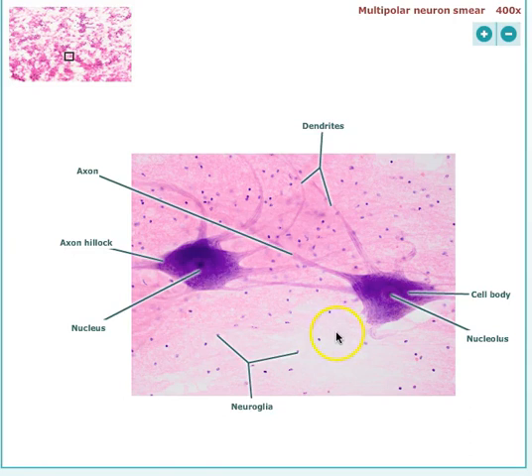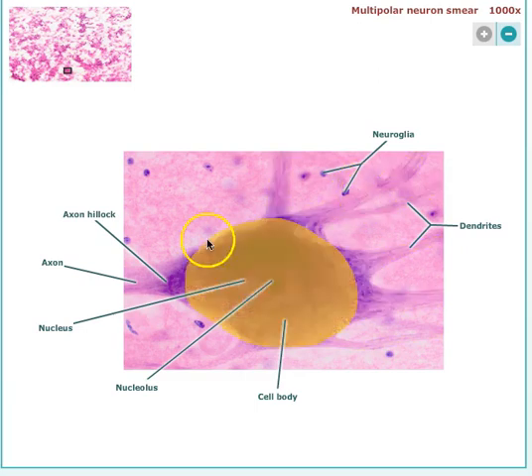But these, just looking at them, these guys here, these are the glial cell, also called neuroglia, okay? So here, looking at the cell here, there's the axon hillock, and then these are all of the dendrites coming off. So you see there's multiple dendrites coming off, so that's what makes it multipolar. We can get even bigger.